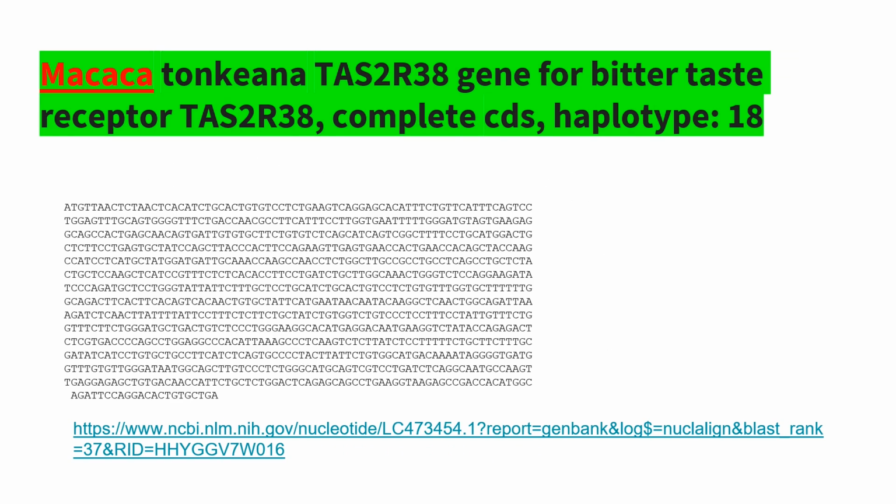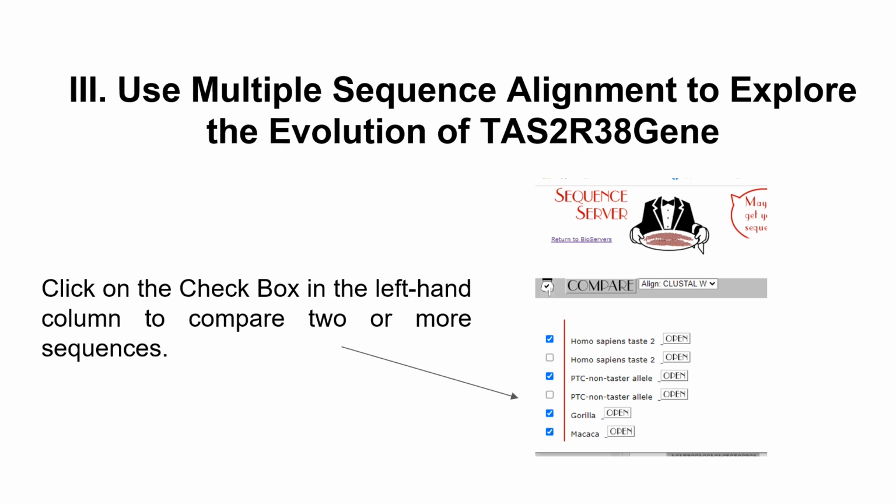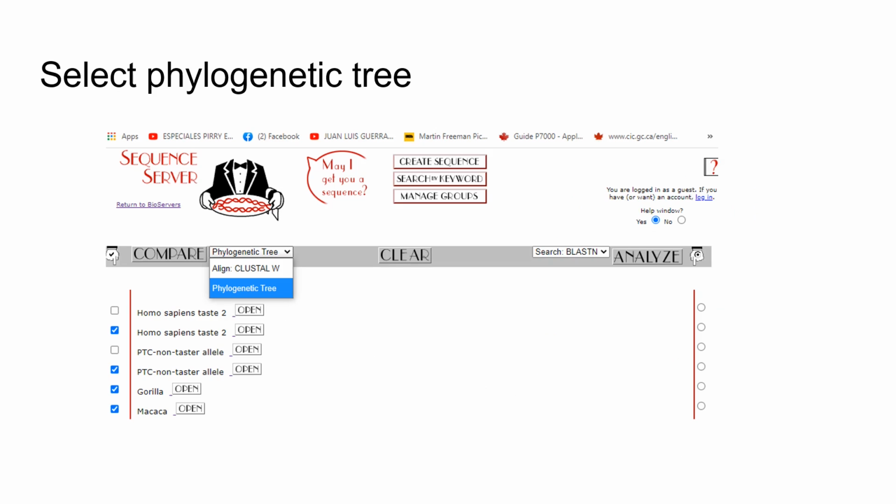And here in green, I uploaded the Homo sapiens one twice. I can delete it, or I can just unclick it. If I don't click this one, I will only compare the ones that are in blue. And here, as I said before, you decide what you are going to compare. You can compare the phylogenetic tree or the sequence base to base.